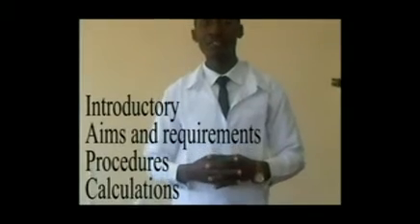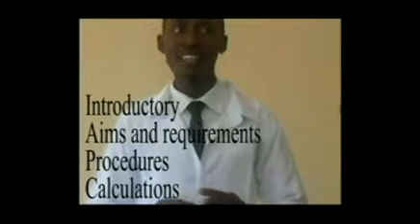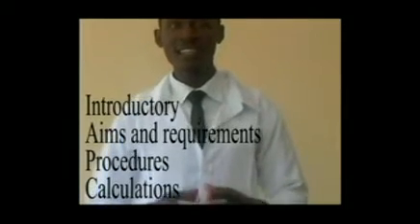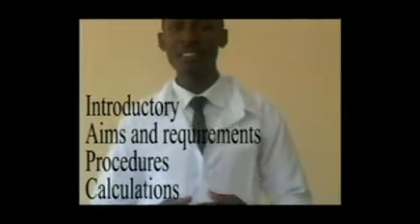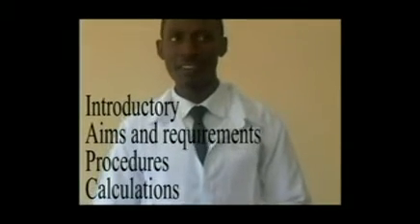Our talk will consist of 4 parts. First, we will deal with the introductory part of volumetric analysis. The second part will be on the aims and requirements. The third part will be on the procedures, and the last part will be on the calculations.